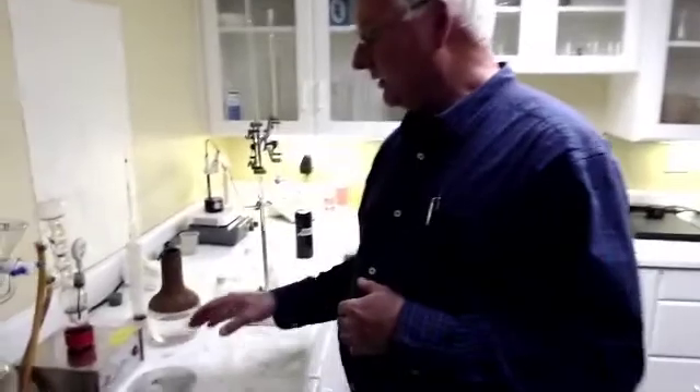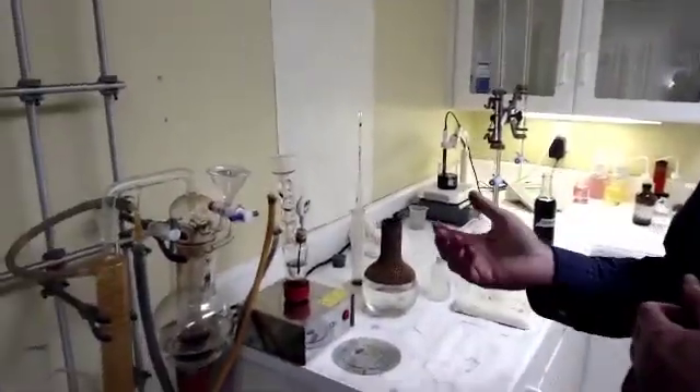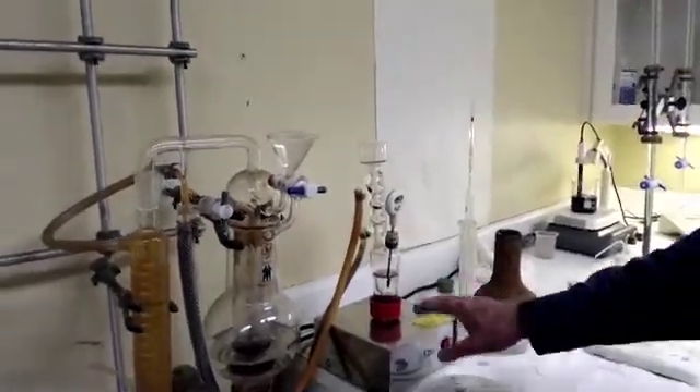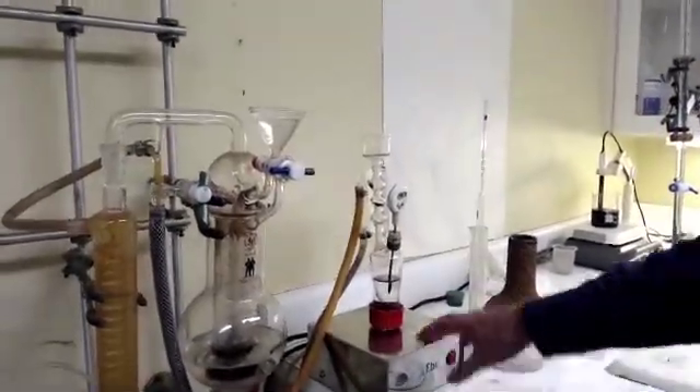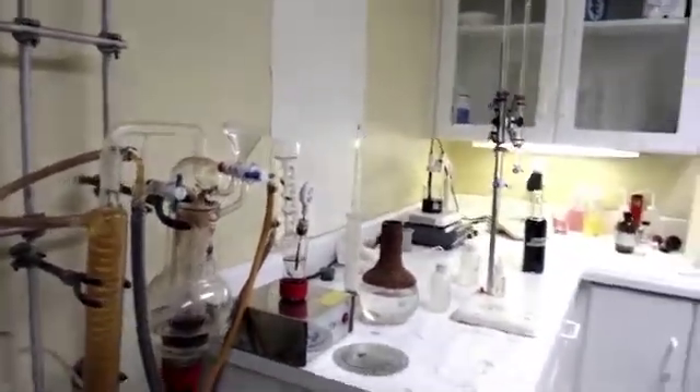The machine that we use is called an ebulliometer and it's made in France. There's one also that's made in Italy. There's two different types: an electric one which is much easier to use, and then there's the old type which I've been using for years and years.